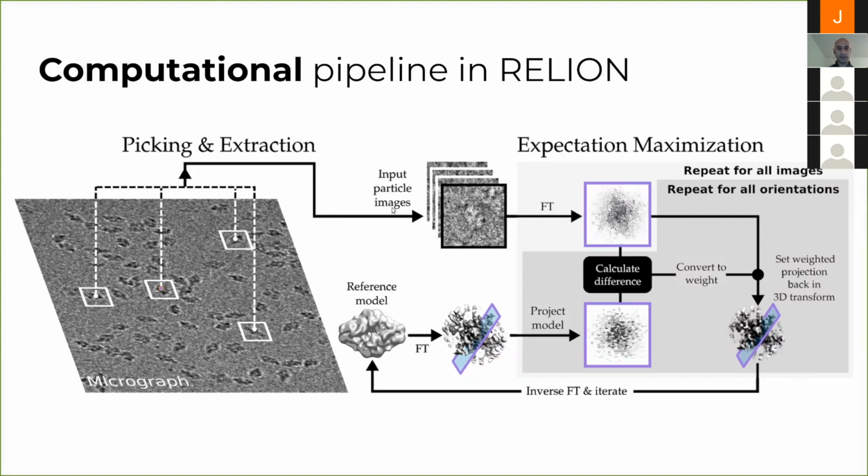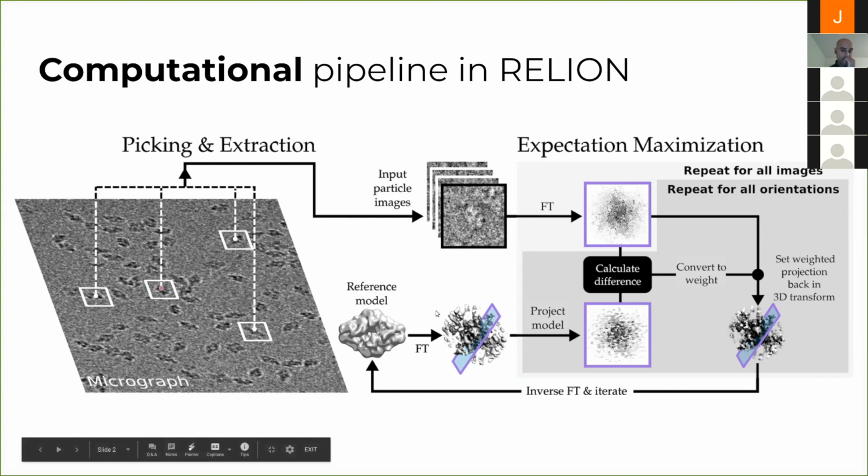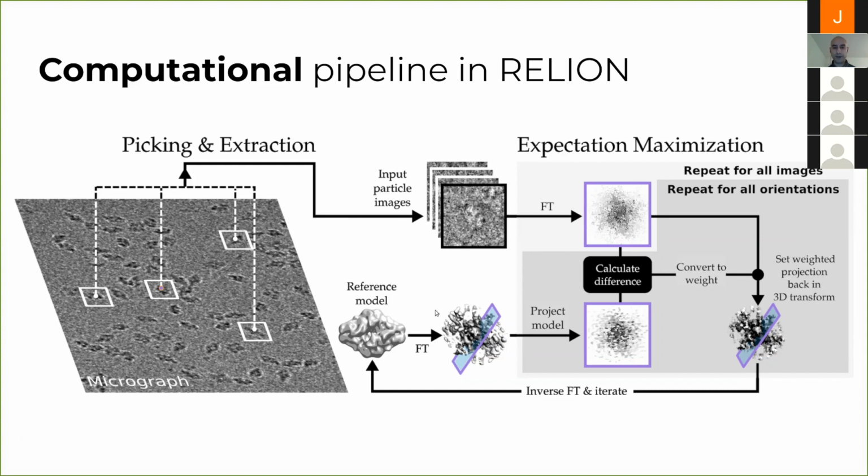And then you put that into a refinement algorithm, which lies at the heart of this entire pipeline, either in 2D or 3D.